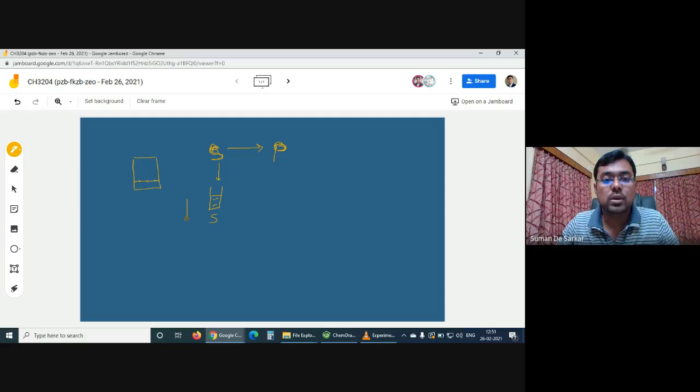So normally I will show you a capillary. Very thin capillaries are available, glass capillaries. Just dip it here in the solution, and with the capillary action, a little will go inside the capillary, and then you take this capillary and spot it here. So this will be the spot of S, the starting material. And from the reaction mixture, suppose this is your reaction mixture, you have all the reaction stuff. Here, the same, you dip the capillary here and take it out, and here you spot it.